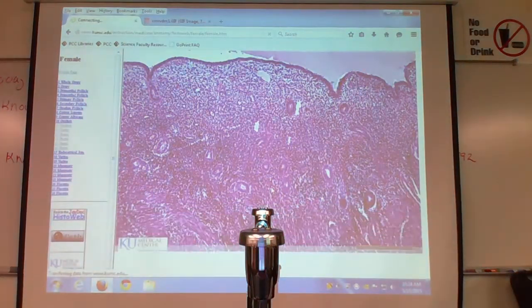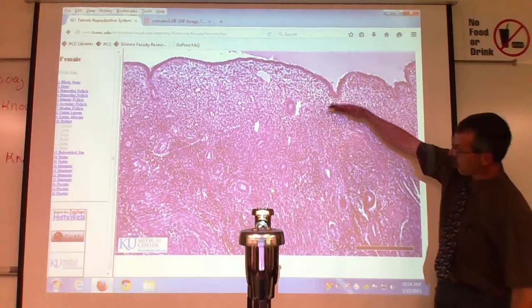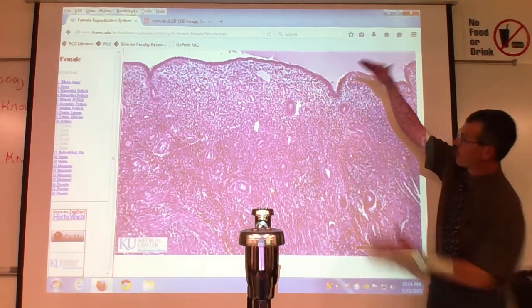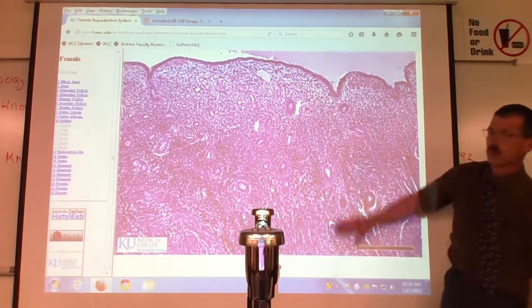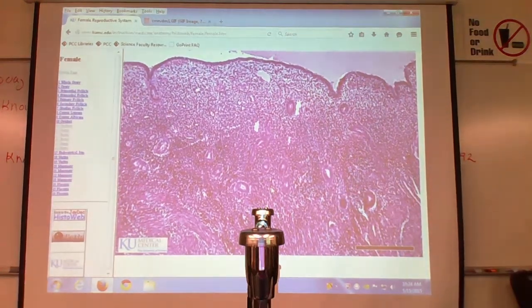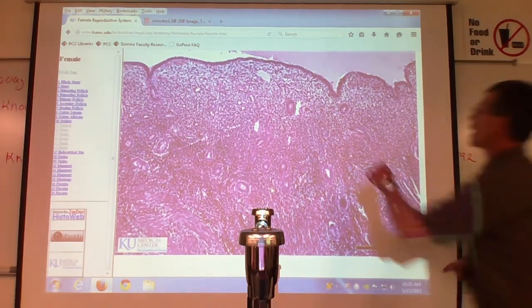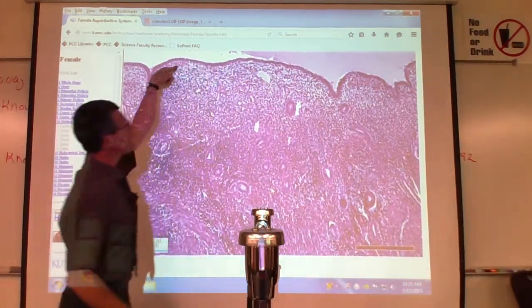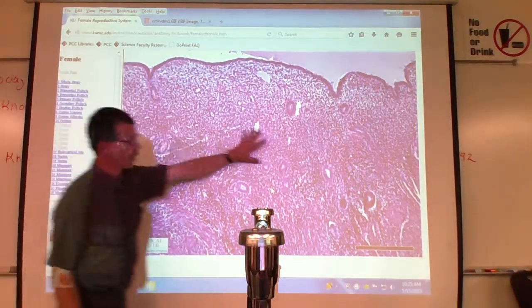This one kind of shows it. As you go down, I'm getting darker, closer together. So functional layer definitely here, basal layer about here. Right, it's just the bottom of the endometrium. Yes. What's the really thick, skinny layer at the top? That's actually the epithelium of the uterus itself. Right, versus all the connective tissues and things.